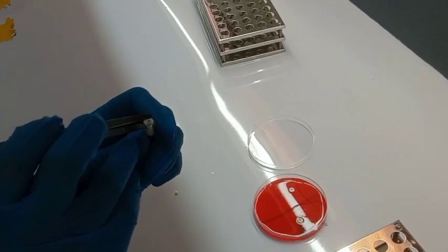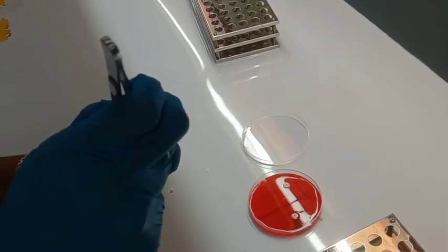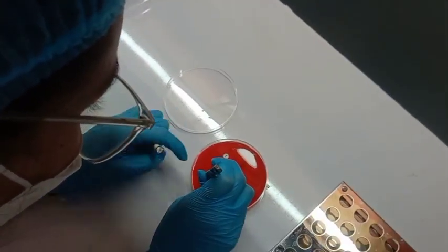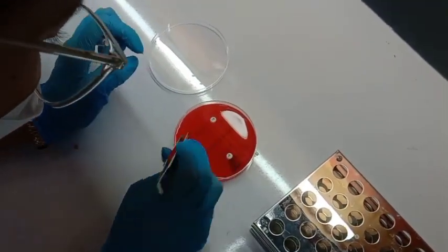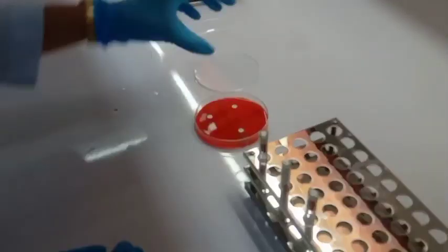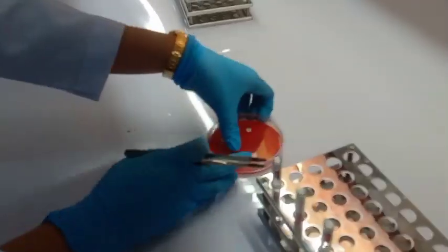After that, we can proceed to placing the optochin disc on the area of the plate where the Streptococcus was streaked. After that, we can incubate the blood agar plate for 18 to 24 hours.